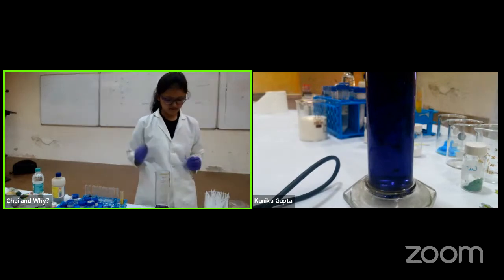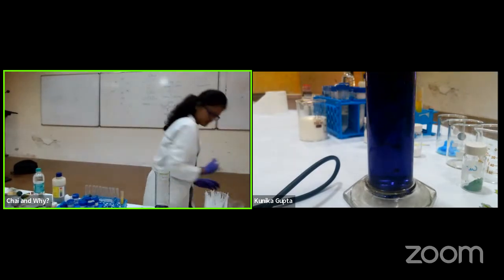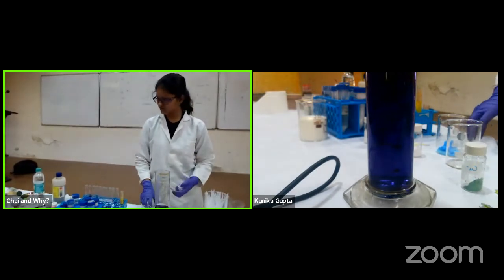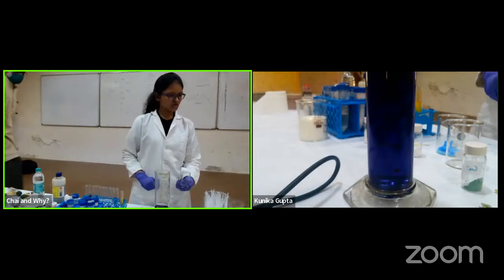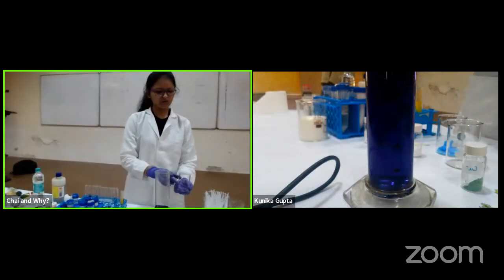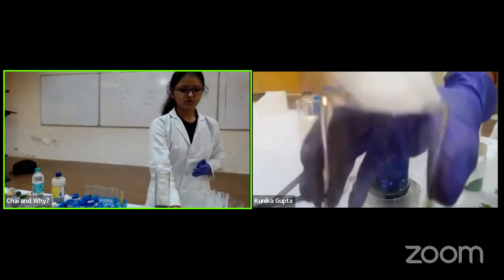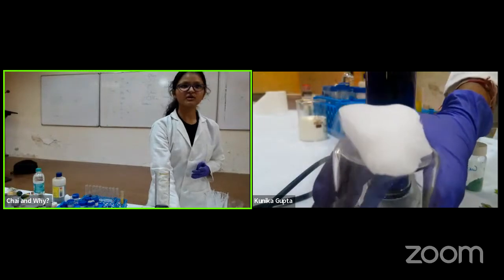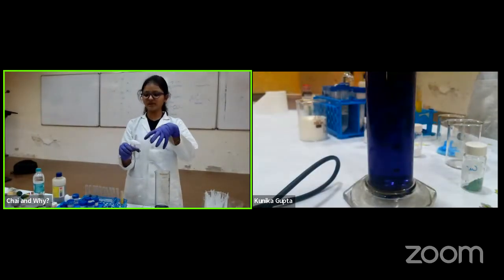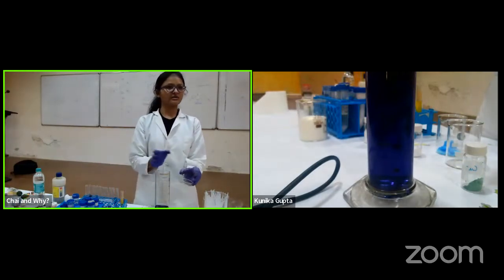Okay, so here I have dry ice. Now you see how it is fuming. It should show up here on the camera. You see how it is fuming here. Ice does not do this. There are fumes with ice, but not this much, right? It's glowing like an agarbatti.